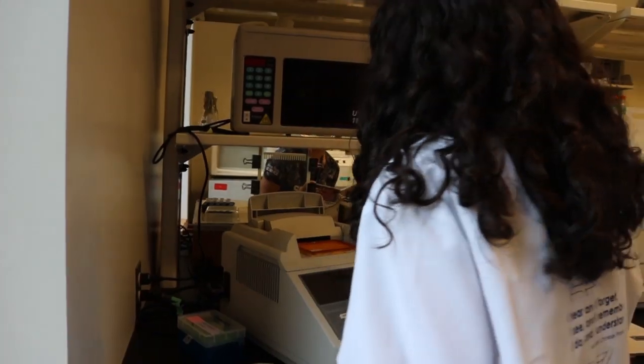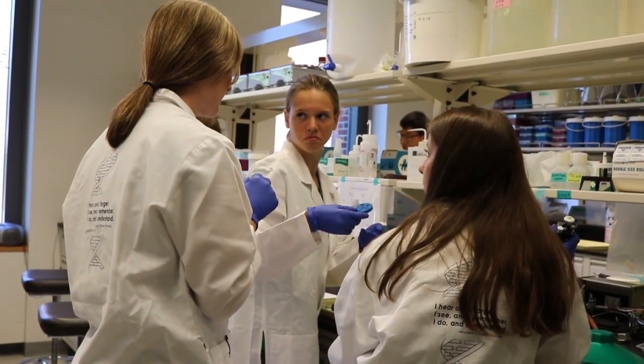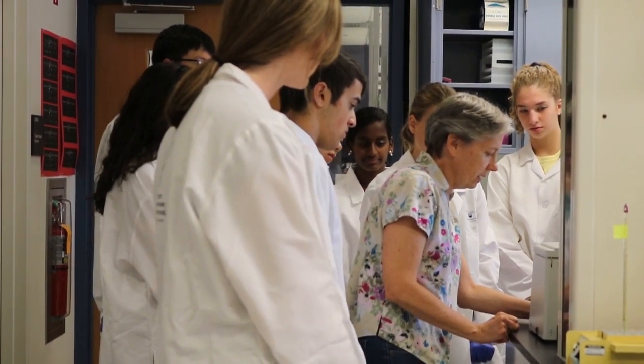This week at the Biotechnology Mini Summer School, students have gotten to learn about DNA cloning and PCR. For PCR, students really got to learn about designing primers that allow them to isolate a very specific part of their genome. And then they also learned that PCR — this machine over here — cycles through various temperatures. So they learned about the proteins that are needed, the enzymes, and the nucleotides.